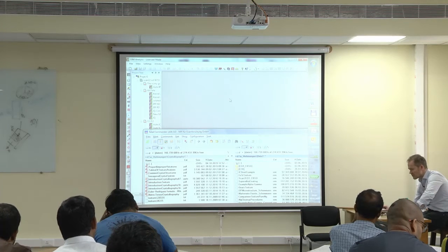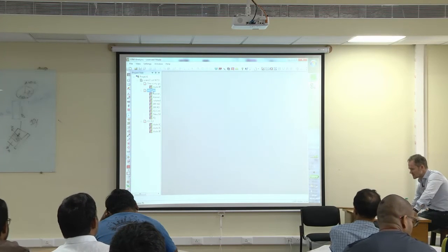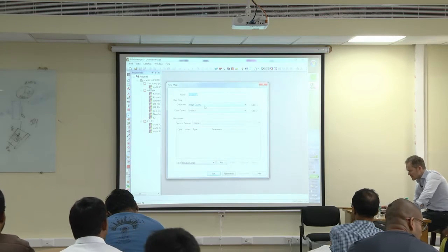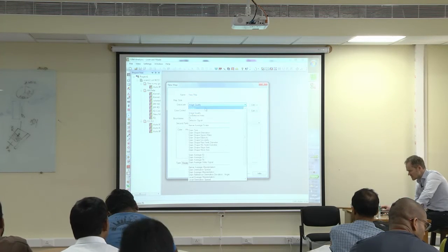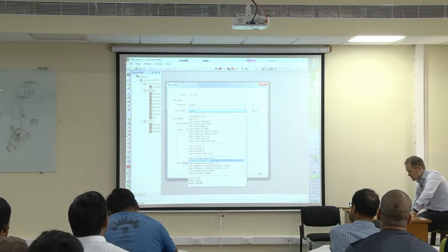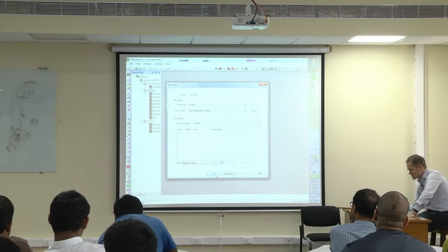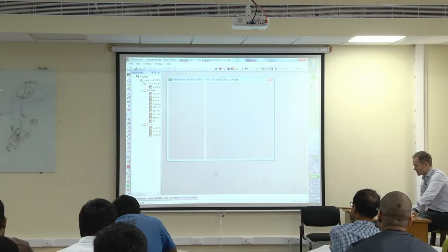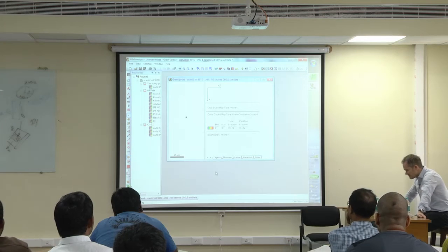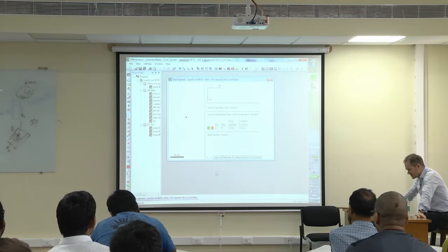Okay, perhaps I have done some operation which dropped some data out. I'm not quite sure. Let's try the map again. Not image quality, but grain orientation spread. Let's cross fingers that this time it works. Oh, this is even less. What's kind of terrible?